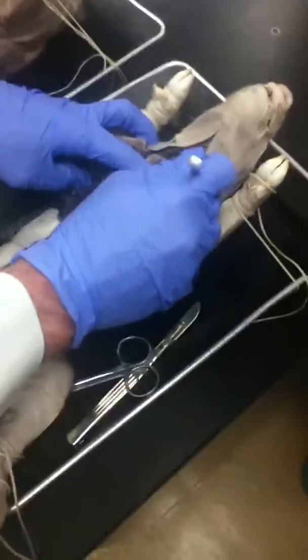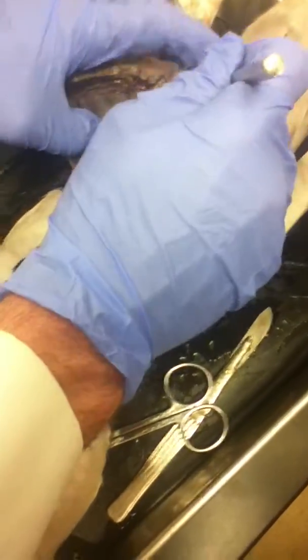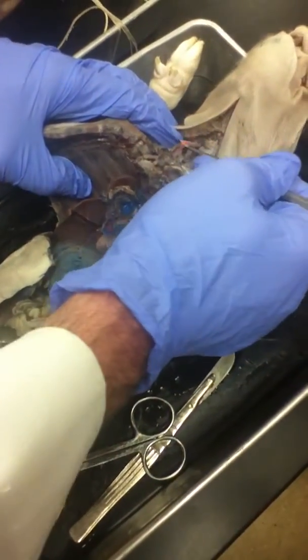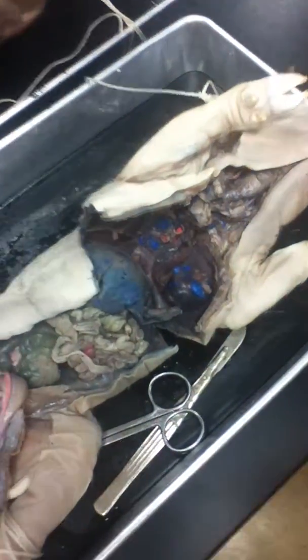Looking over here off to the side, okay, this is going to be your carotid artery, okay, and your jugular veins are going to be over here off to the side, okay. This side shows you a better one of the carotid. There's carotid. Okay. All right. Now your esophagus.